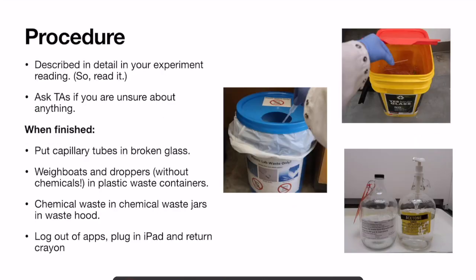Okay, let's see what's next. Okay, procedure. The procedure today is pretty simple. You are learning how to use a melt temp, but it's explained in detail with lots of photos in your experiment reading. And of course, your TAs are there to help you out if you're unsure about anything.